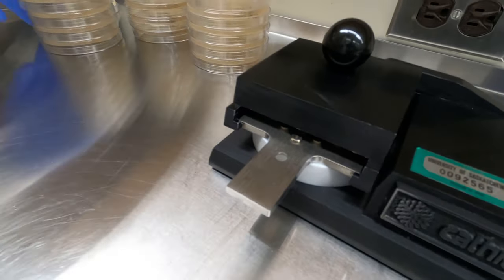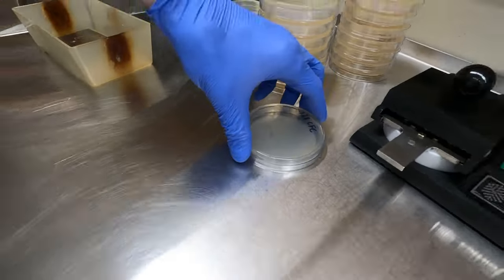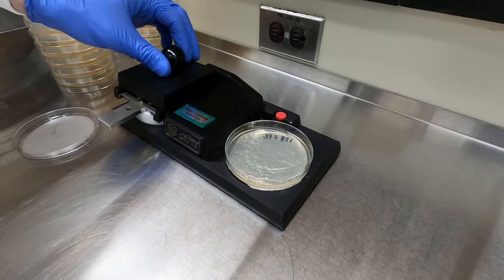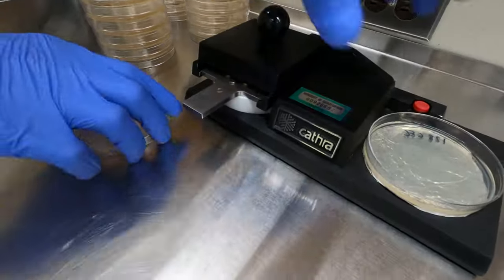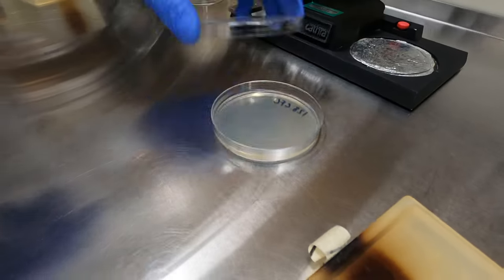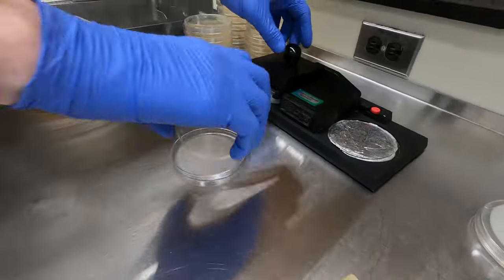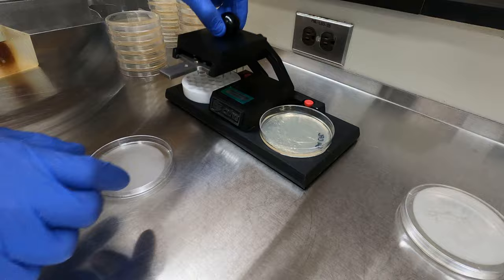Using the arm of the replicator, we then dip our pins into the well plate before placing a petri dish on the other side. We then move our pin plate over to the agar dish, spotting our inoculum onto the Mueller-Hinton surface.